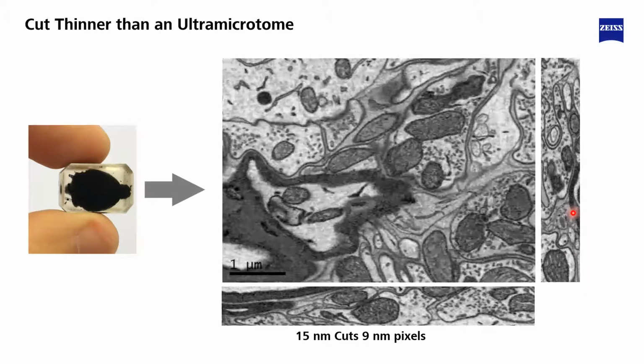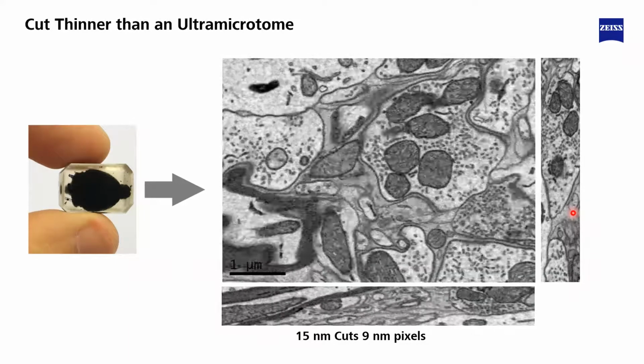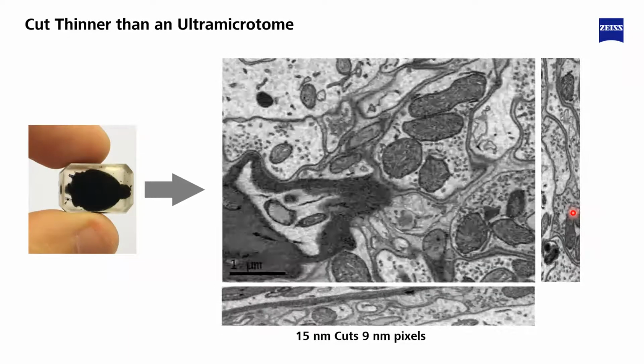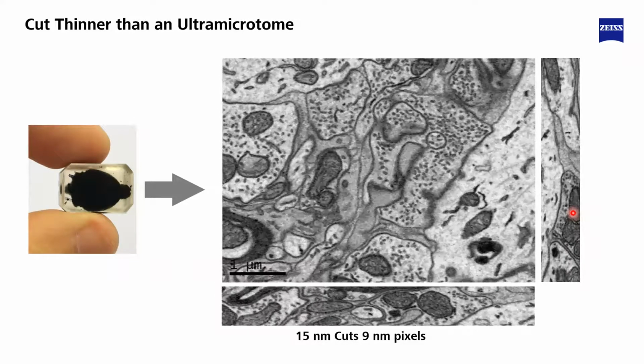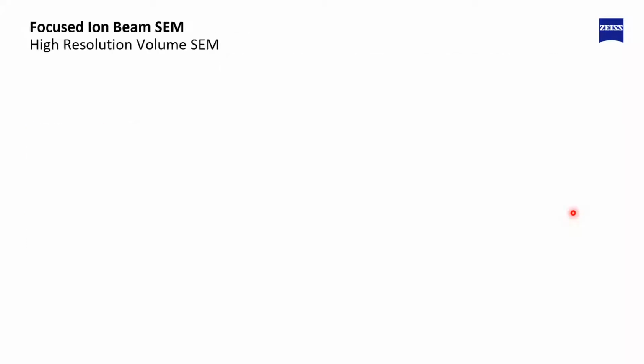And that's what's really making this data extremely rich for analysis of three-dimensional mapping of eventually the cells and those neurons that form connections with each other.